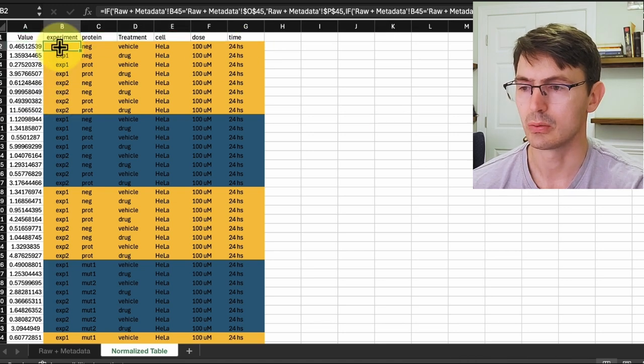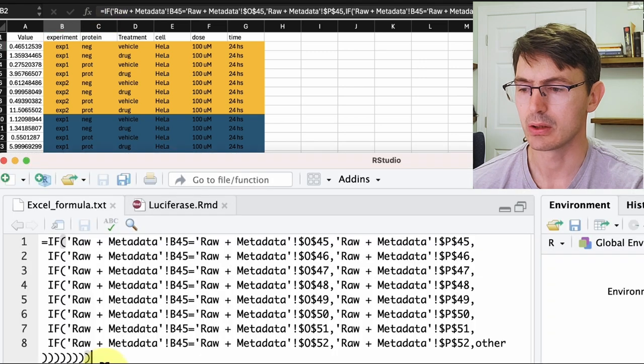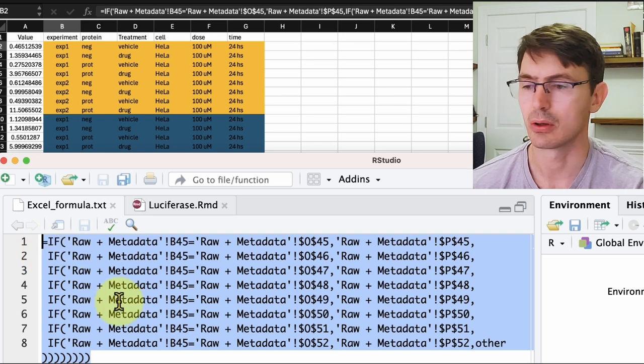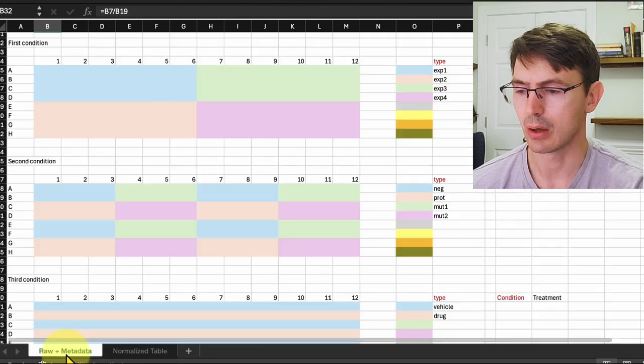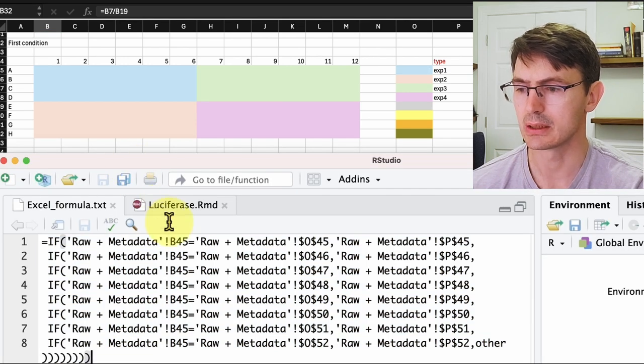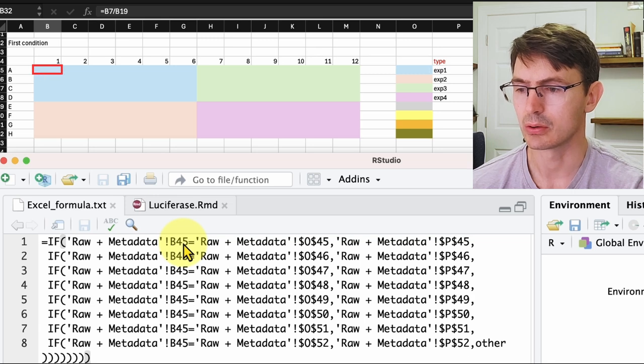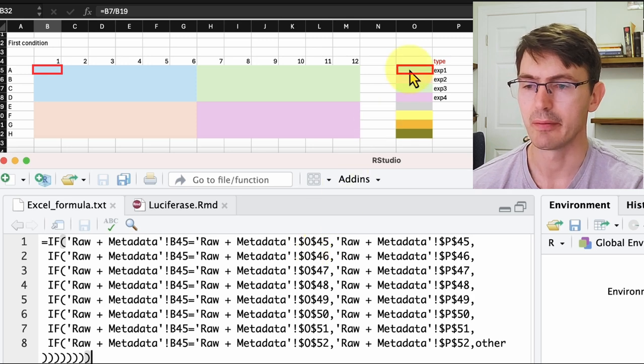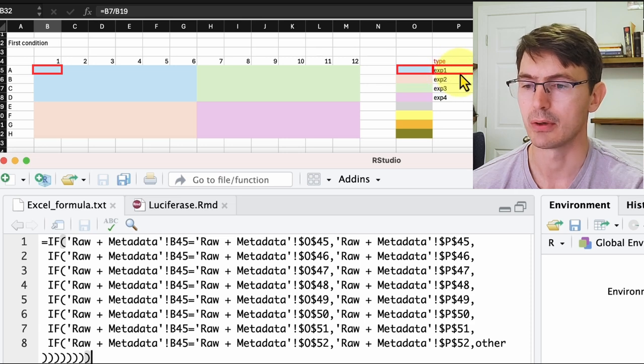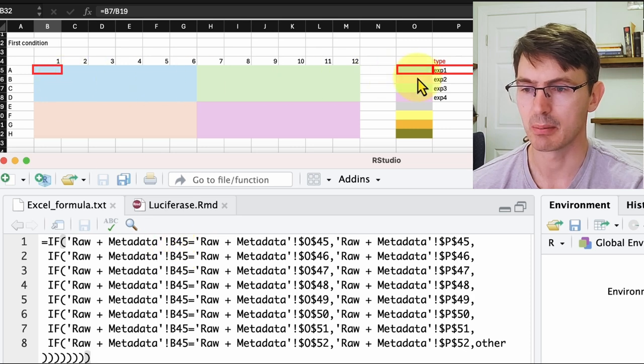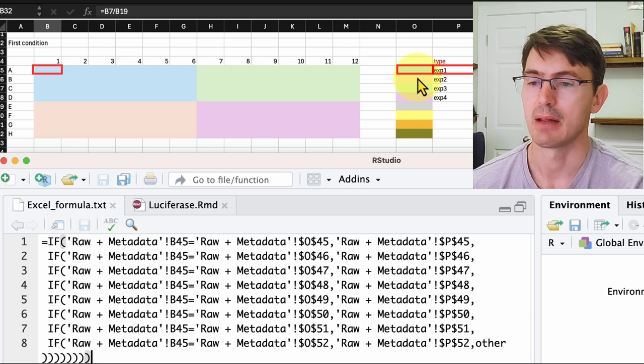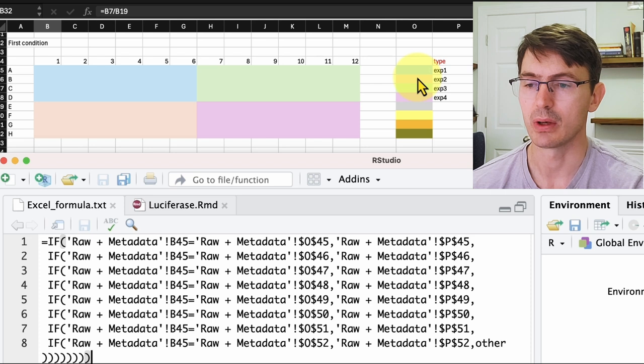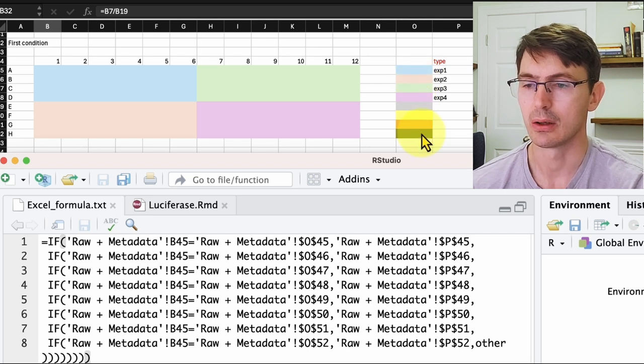We do this with this long formula over here. What you see is here expanded that formula, and we are actually iterating through an if loop. As we go back to our metadata, we see that for example for this cell B45, we want to see if this color is the same as the color in O45. If that is the case, we give the value of P45. If not, we look and see if the color of B45 is the same as that of O46, and if that's the case we give the value of P46, and then we iterate till we get to the end of the conditions.